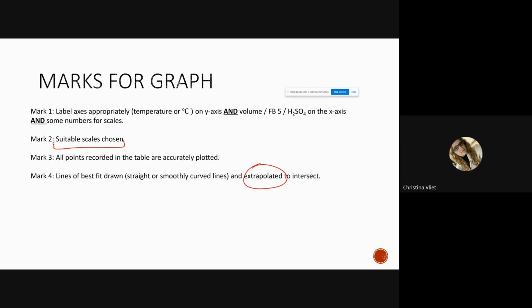So what's the first thing you should do before starting? Grab gloves, grab goggles, write your name. After I pass you the lab, pick a table in the back, read carefully, and you can get started. It'll be homework next class. Anything you can't finish in the class period in terms of the math, you can turn in next class period, but everybody does need to turn in a copy.